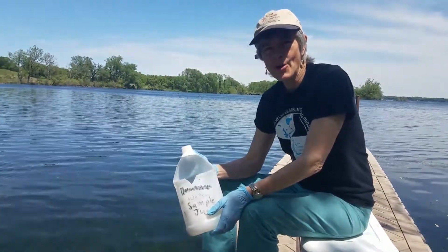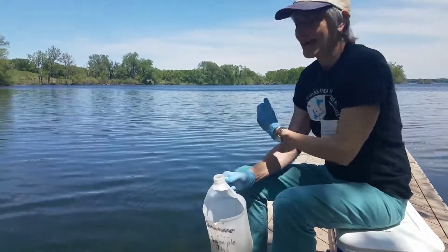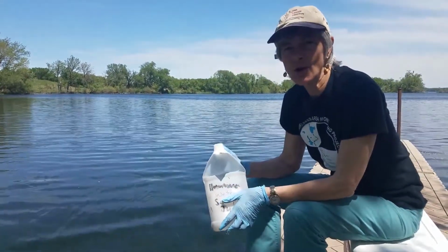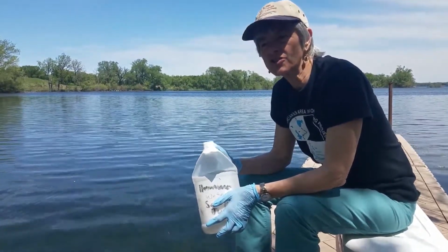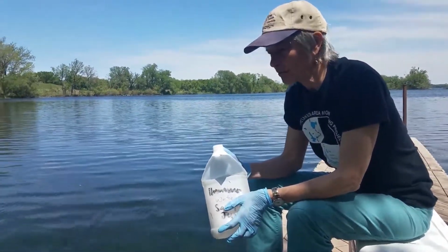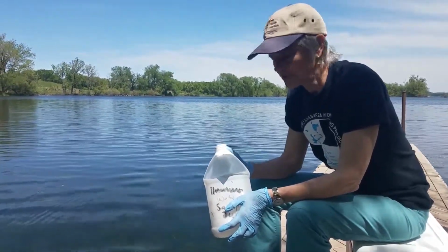Hello, now we're on the boat. This is our pretend boat, sitting here in the dock on beautiful Little Miller's Bay on West Okoboji. And we're going to go over how to use the pH pen. You should use it when you're collecting your water samples. Do the two at the same time and do the pH pen first.